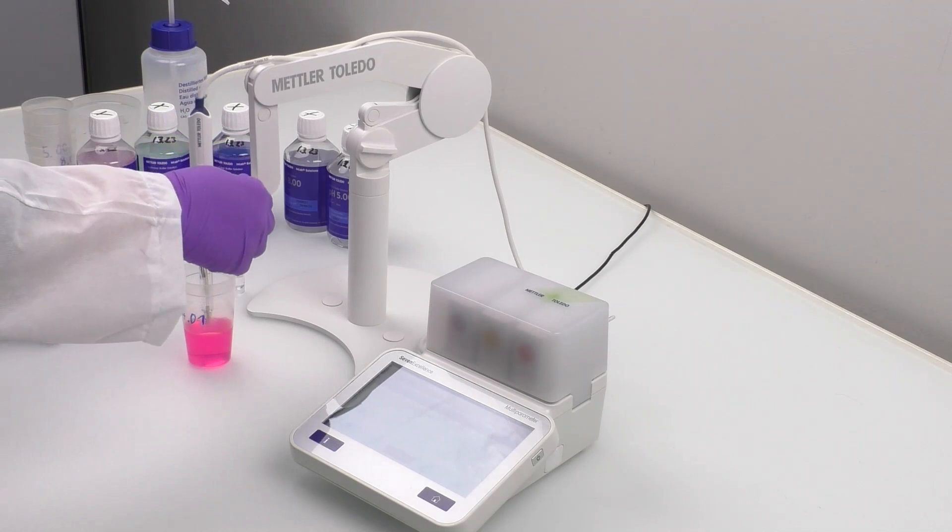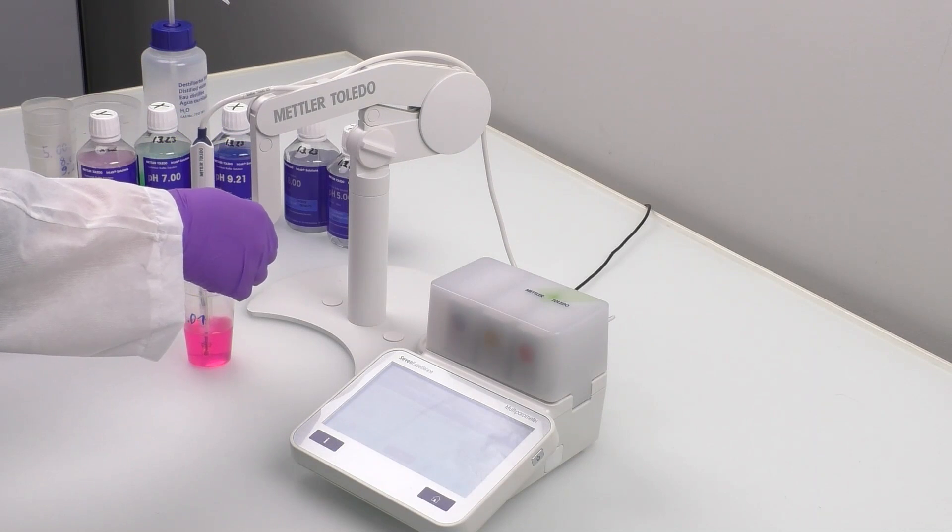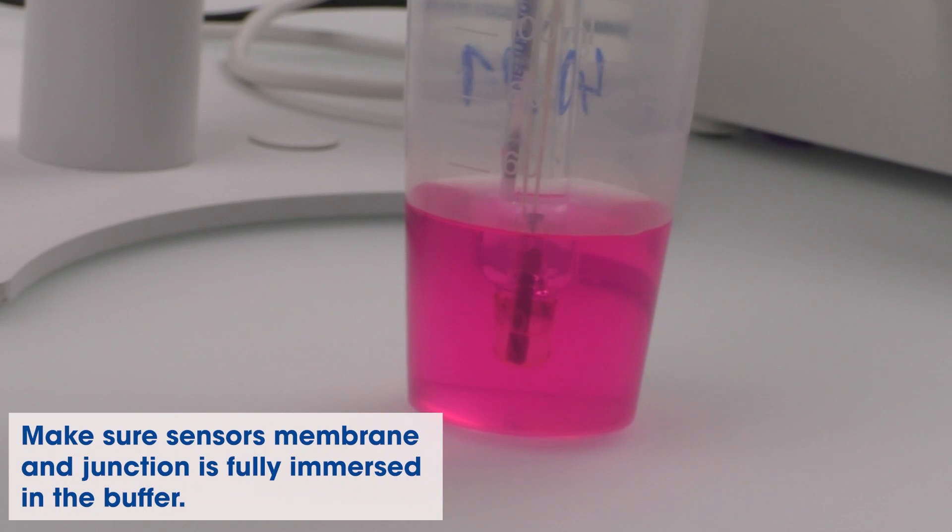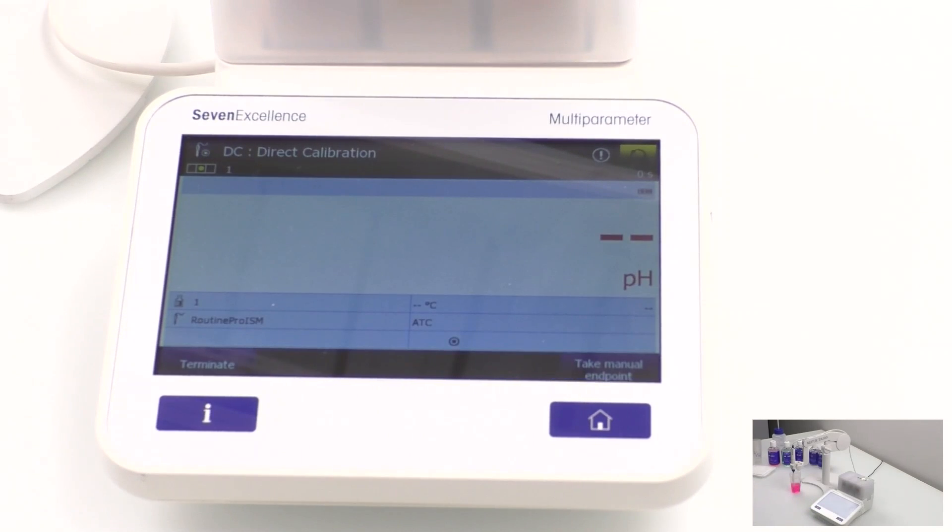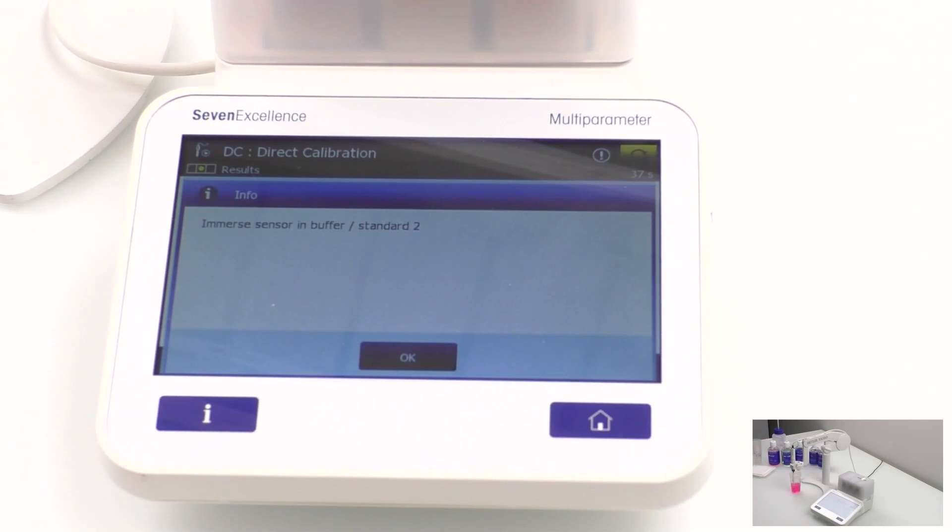Next, immerse the sensor into the beaker, making sure to fully submerge the sensor junction and membrane for accurate calibration results. Once that's done, click OK on the meter display to start the measurement. After the first point calibration is reached, you will see a pop-up prompting you to immerse the second buffer.